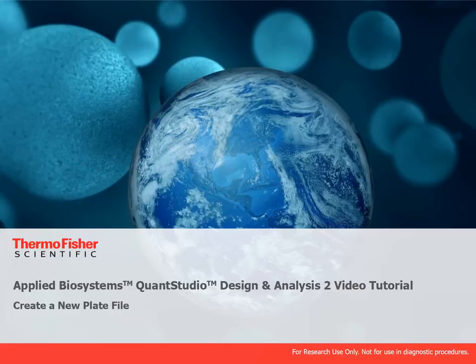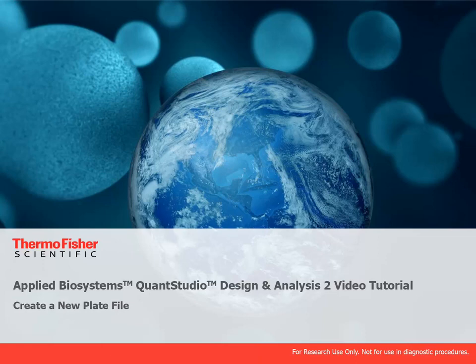Welcome to the video tutorial series for QuantStudio Design and Analysis 2. For this tutorial we will be using the desktop version of the software, but you can also use the application on the Connect platform.